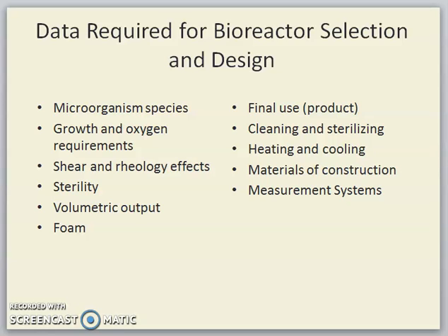And the sterility, this is very important in bioprocess or biofermentation. On hygiene, we need to know the procedure for sterilizing, by using steam blasting, or in the lab, we use an autoclave.